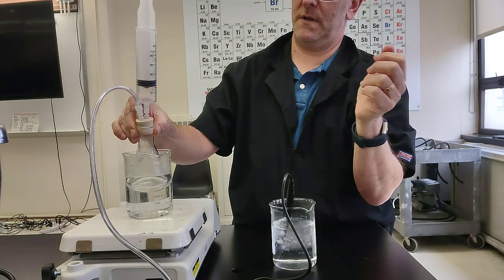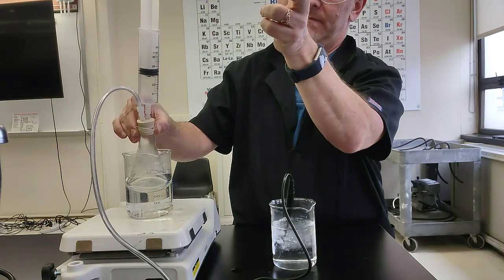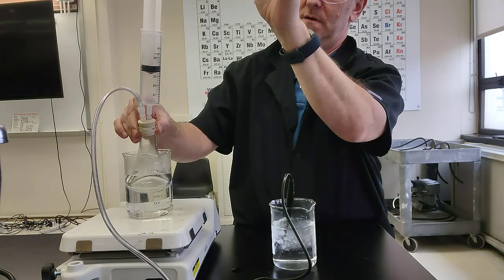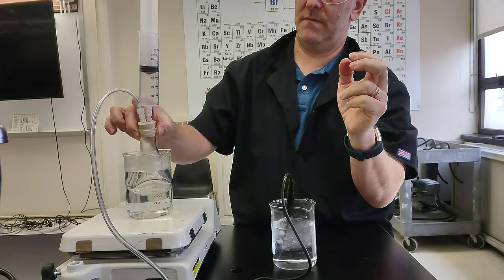Immerse it in the water a little bit. See how it bounced up much higher that time? And higher still. And higher still. We're at 35 milliliters now.